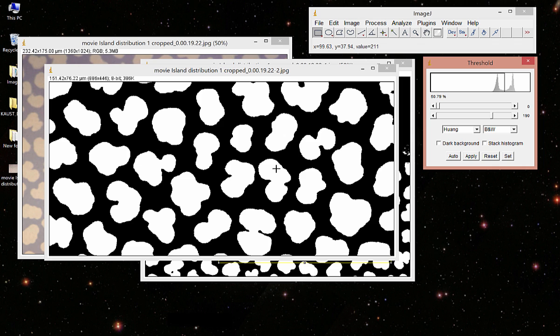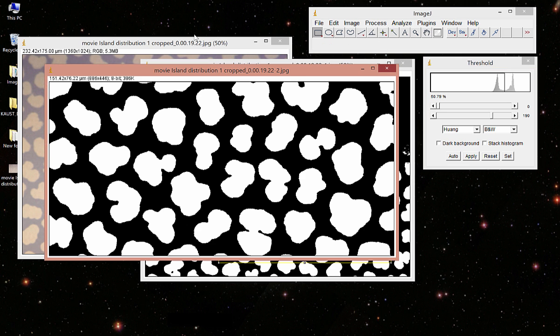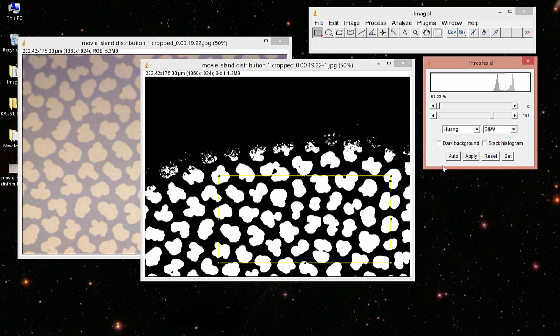But if we want to threshold the entire image, then we have to use a filter. Although there are other ways, in this video we use a filter to maintain a uniform background throughout the image.